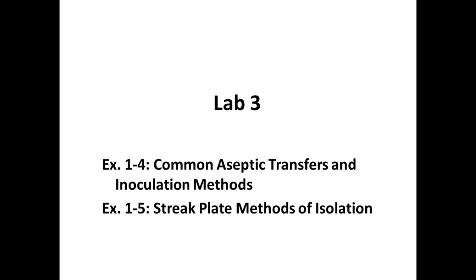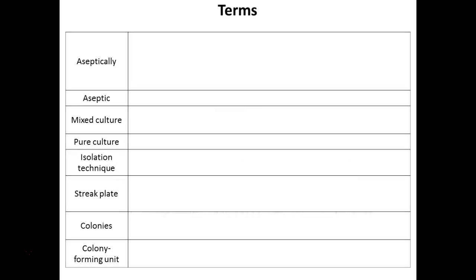So in addition, on your lab bench, in your group rack is a culture that has the label mix. It's actually a mix of two organisms that we did in a broth culture. That you're going to use the streak plate method to isolate out those two organisms, hopefully.